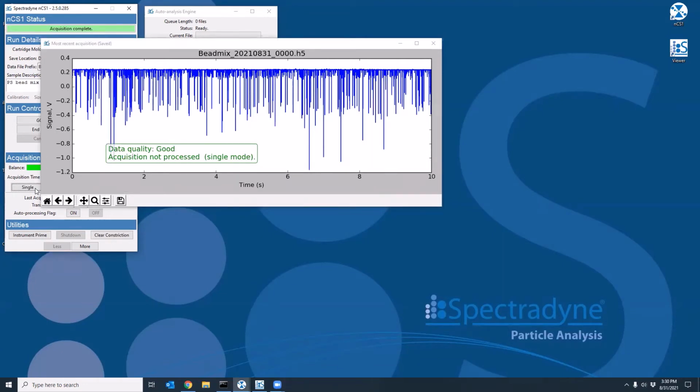This video will help you to identify the condition in which the particle concentration in the sample is too high. We will help you to recognize the symptoms in the raw data so you can quickly make the necessary adjustments to your sample preparation to ensure accurate size and concentration measurements.